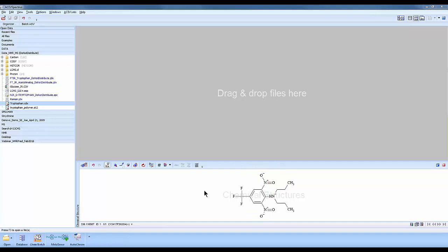Before collecting an HMBC, which can spend a lot of time trying to figure out the spectral widths, you can do an NMR prediction first and use that to judge what the spectral widths should be so you don't get any foldback in your spectrum.